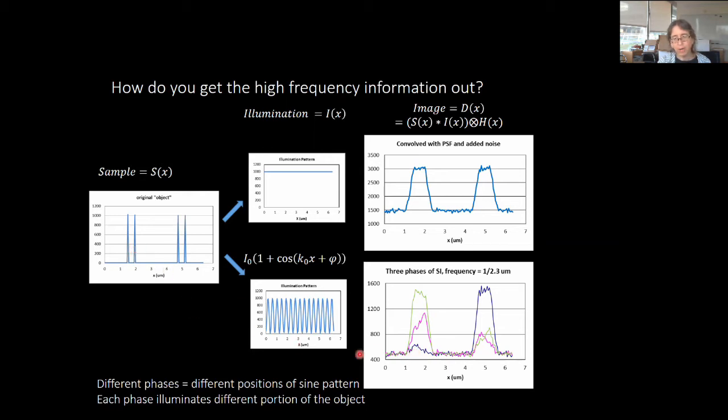And that's because both of them are lined up with troughs in your sine wave. And when you shift the sine wave and take another picture, they're both lined up with some intermediate intensity in the illumination. And when you shift it again, you get most of the signal out because now you've lined up the peaks of the sine wave more or less with their 2 point objects.